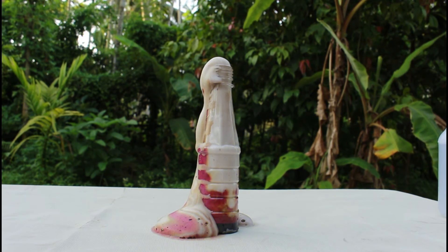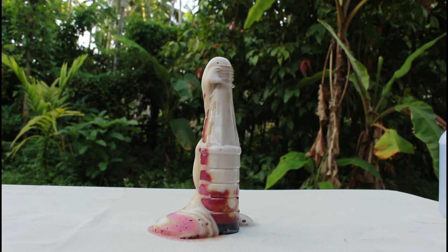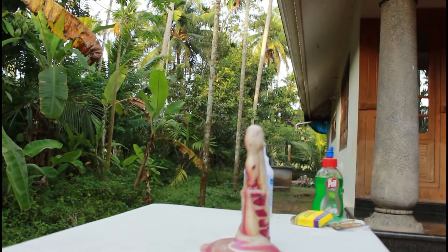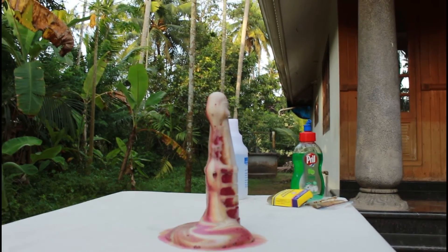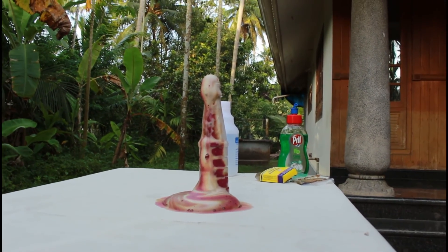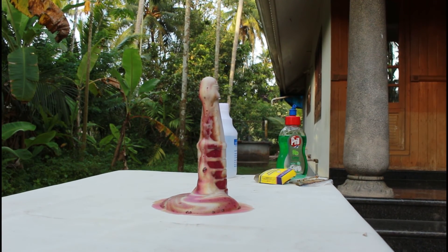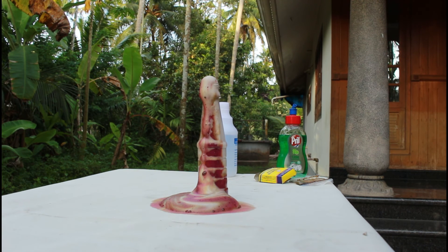You can see this — I'm just gonna show you the other side because the reaction went to the other side. Yeah, you see that? Look at that — that's the elephant toothpaste experiment done!